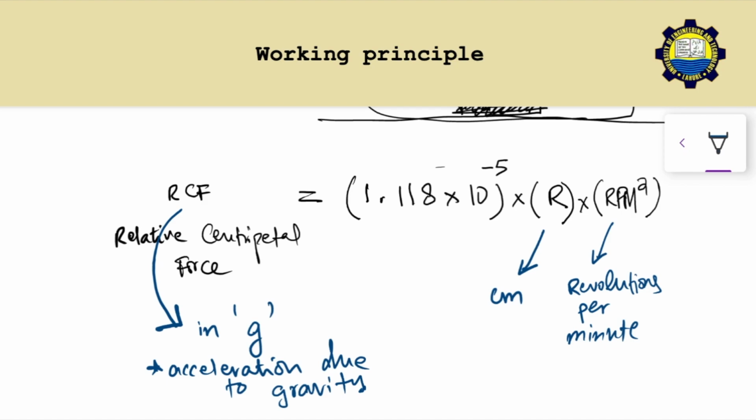So at a fixed centrifugal force and at a fixed viscosity, we could fairly say that the sedimentation rate of a particle is proportional to its molecular weight. It's proportional to the difference between the density of the particle and the density of the solution. Greater density implies that the size is large and there's more centripetal force acting on it, so it separates quicker. We've talked about centripetal force acting on suspended particles and pushing them to the walls of the tubes and eventually to the bottom of the vessel. But there are two forces that counteract this centrifugal force.